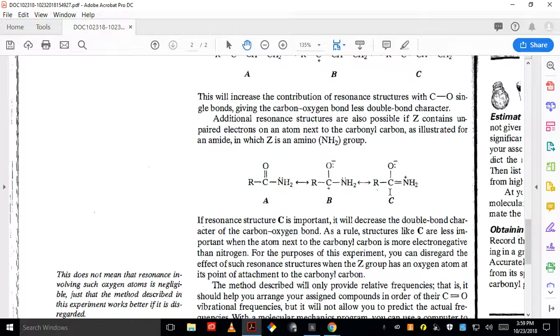But if you have oxygens over there, it still would not be as much of an effect, but it still would be somewhat of an effect as if an oxygen wasn't there. But in that case, we'll probably try to avoid compounds that have the oxygen there to mess you up.